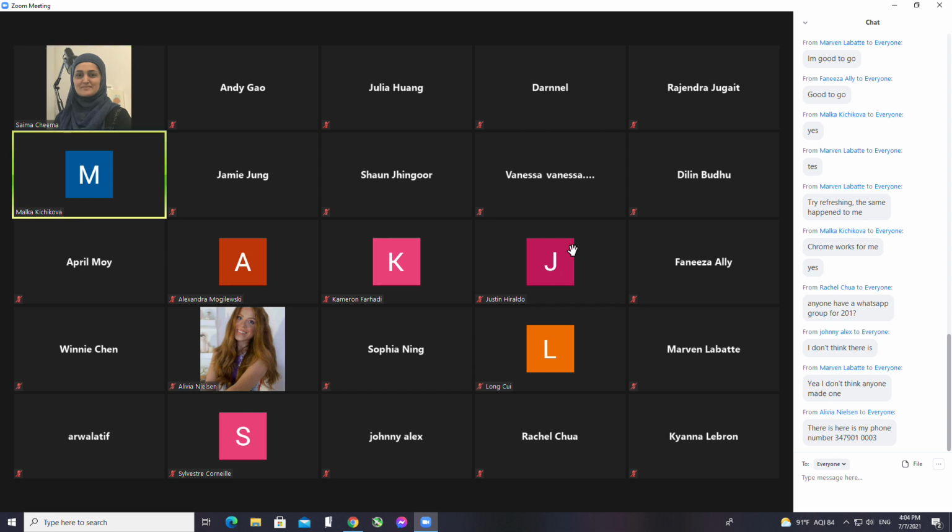So how do we figure out what goes into that last column? You figure out what's the distance in one. You figured out how many stage units equal the whole ocular ruler. So now you can figure out how many divisions equal a certain distance. Okay, so think about it a little bit, let everybody else complete what they're doing, and then we'll talk about that. Okay, thanks.